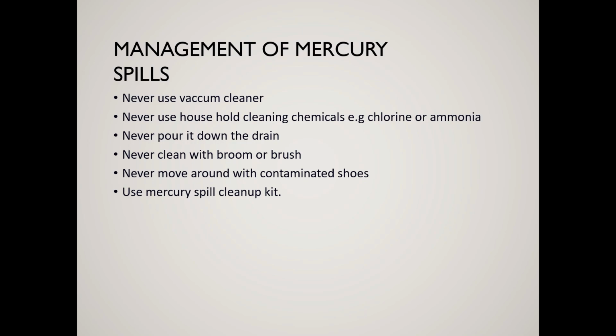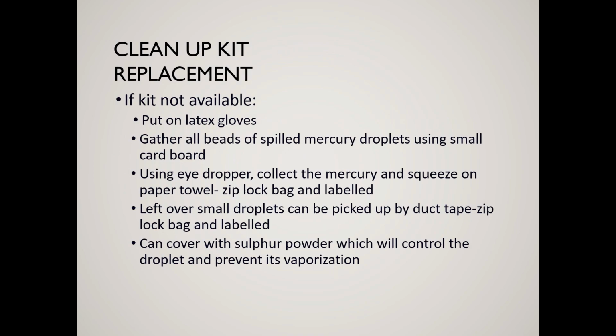Use a mercury spill cleanup kit. And what does a mercury spill cleanup kit consist of? We are going to read it in the next slide.